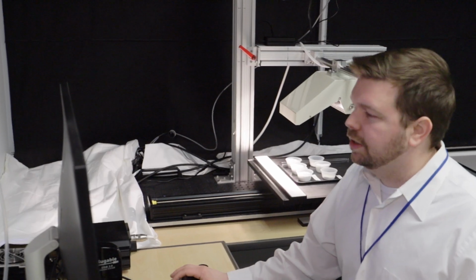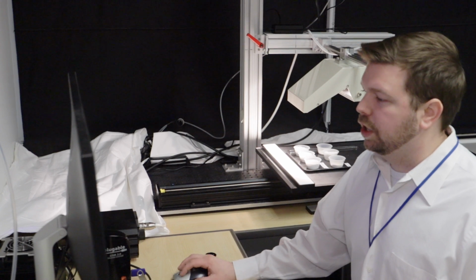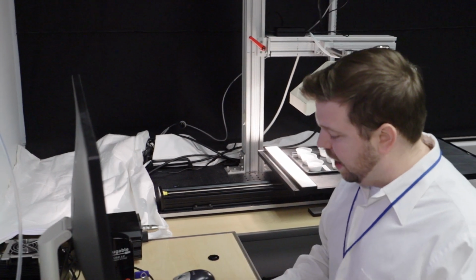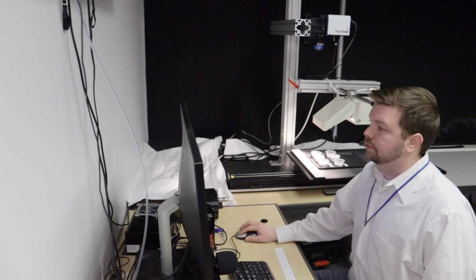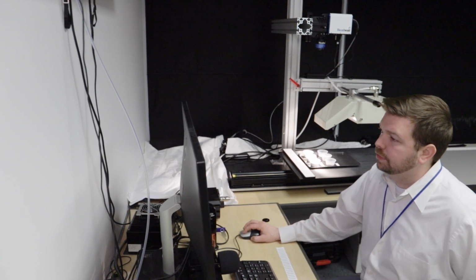So I often set the start and stop position while looking at the waterfall and using the motion tab. So if I want to find the last position or the end of my scan, I will usually enter in a large number and watch as the sensor moves past my sample.